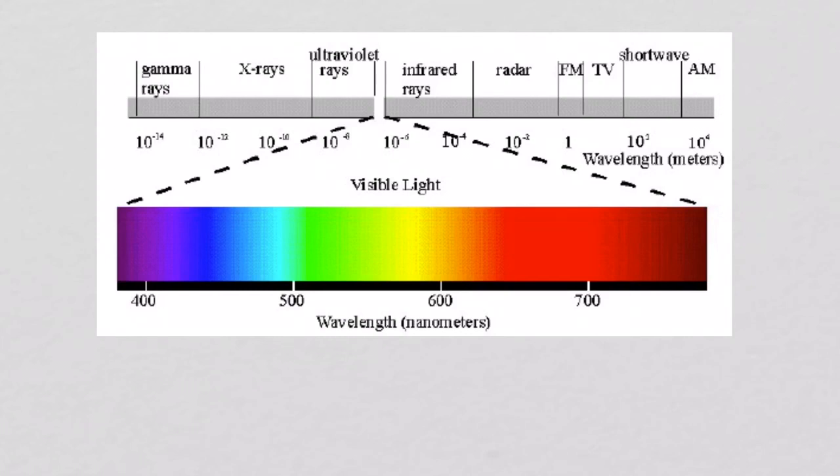All a theme on electromagnetic radiation. So the visible light usually goes from about 400 to about 800 nanometers. The ultraviolet light goes down. It has a shorter wavelength. We don't really worry too much about the wavelength at that point. We are just simply trying to figure out how this radiation interacts with matter.